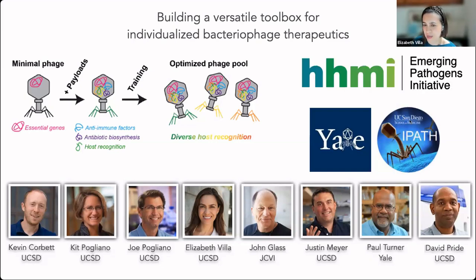We're very lucky to have gotten funds from the Howard Hughes Medical Institute to pursue this. We want to go all the way to preclinical, which means that we're going to get patient samples. We're studying Pseudomonas infections in people with cystic fibrosis, who develop antibiotic-resistant pneumonias.